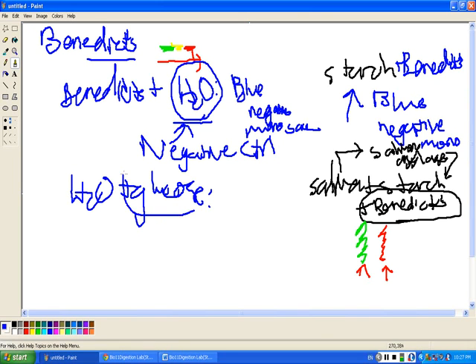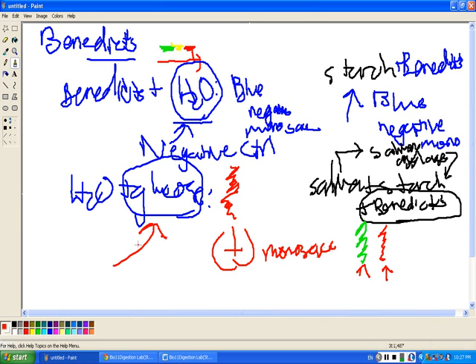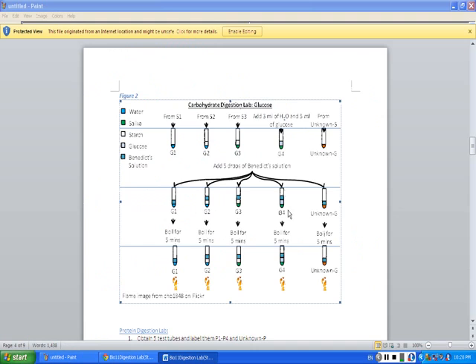Of course, now we're adding glucose, so we're purposely going to try to have a positive result, because we know Benedict's reacts with glucose. It's going to be really bright red in color since it's pure glucose that we're putting into it. So of course it's going to be positive for monosaccharides, and this will be our positive control, due to us adding glucose in this particular test tube.